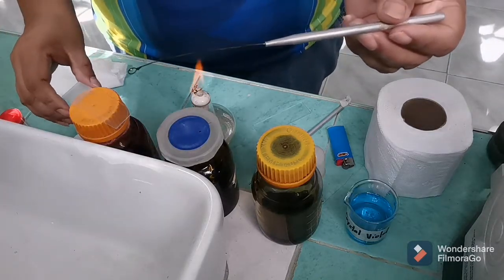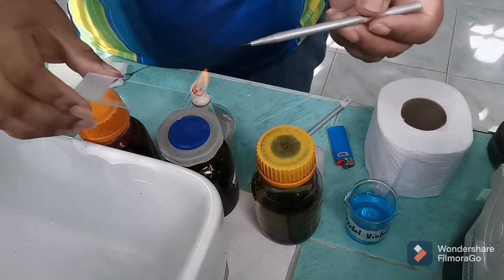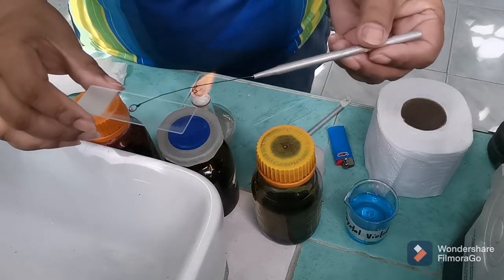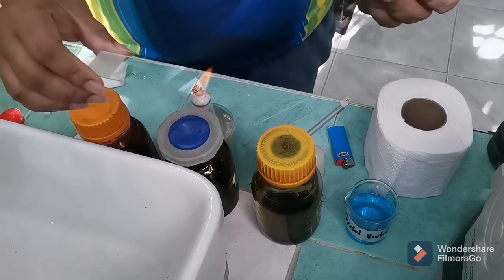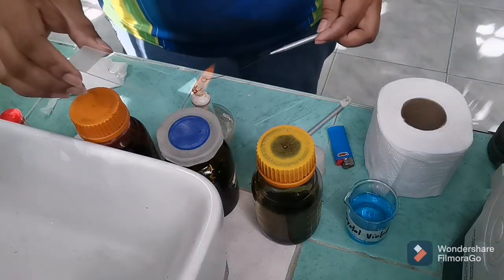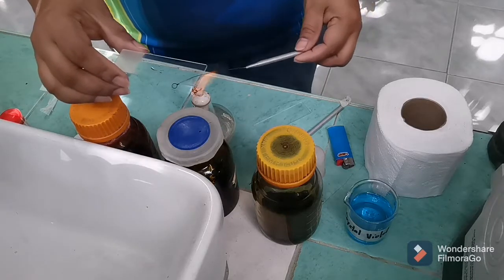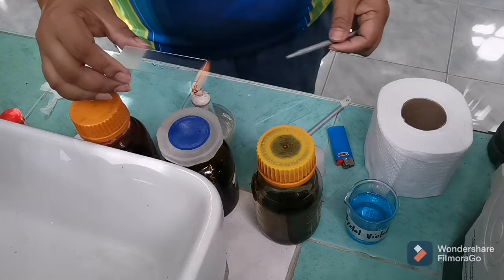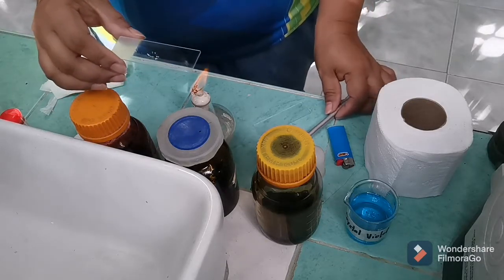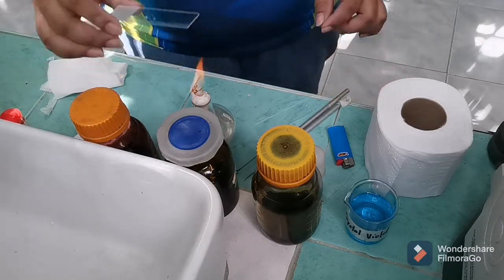After getting some of the sample, I will tap it at the top of the slide. After using the loop, you again incinerate the inoculating loop in order to prevent contamination or spread of microorganisms in your working area.